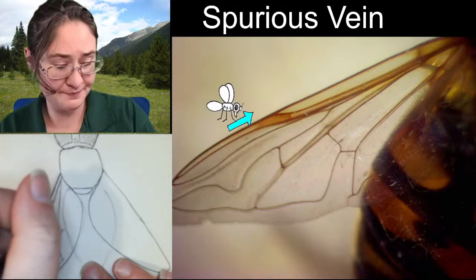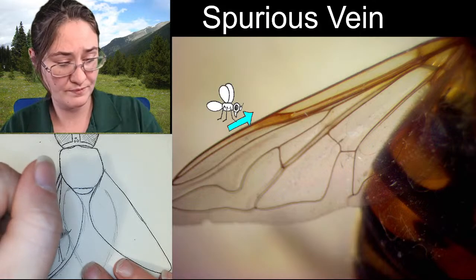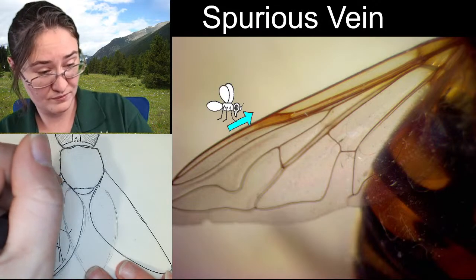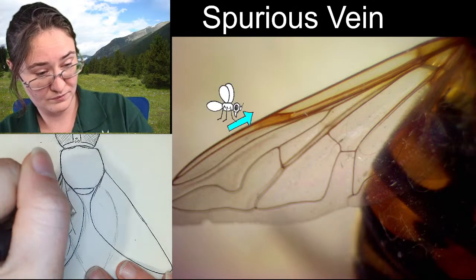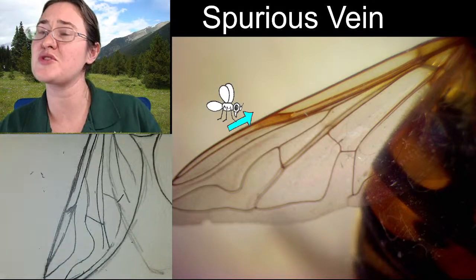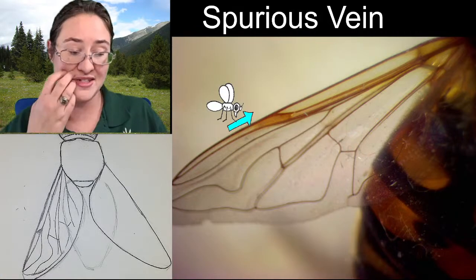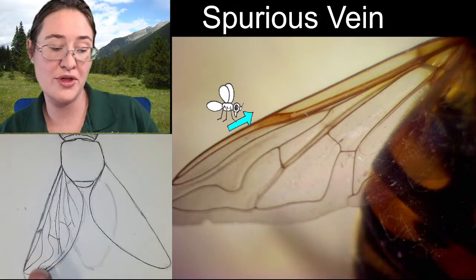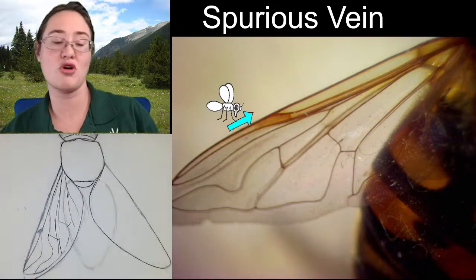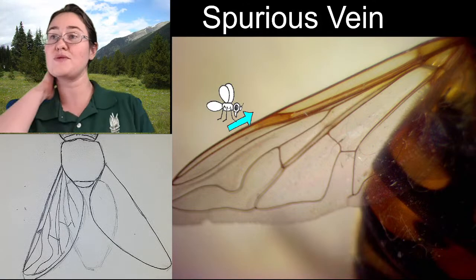All right. So I've got this wing mostly figured out. I'm going to leave the other side of my sketch without the veins so that I can see more of the abdomen on this side. But you can choose the way you would like.